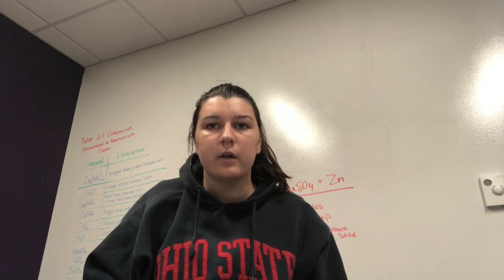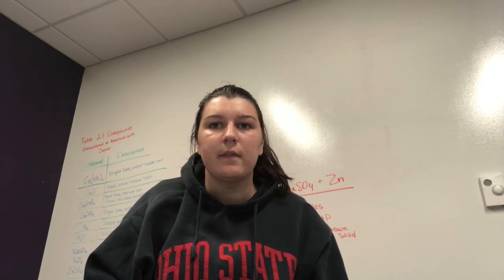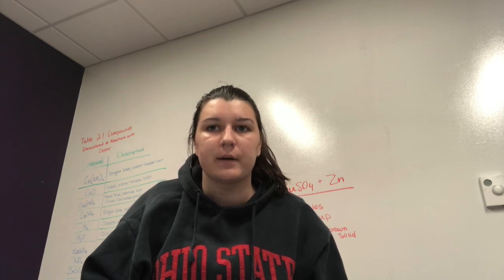My name is Carly McFarland and I'm in Section Lab 9. And this is the video lab report for experiment number 2, reactions of copper and percent yield.